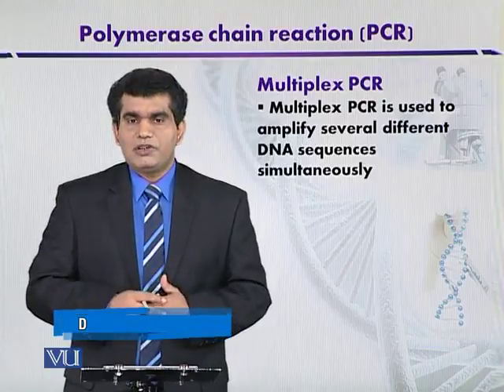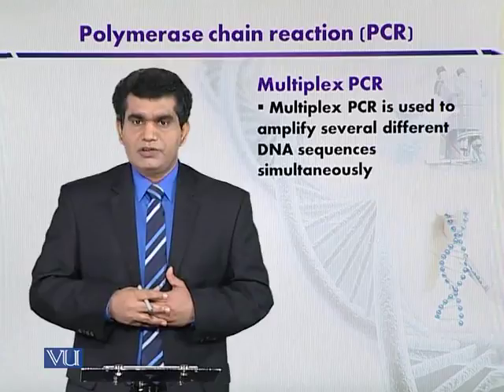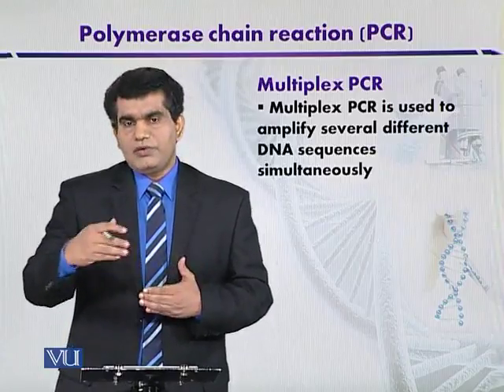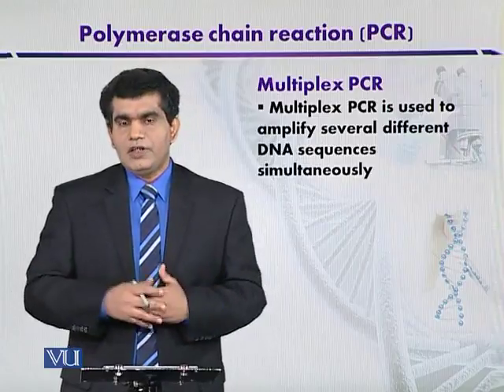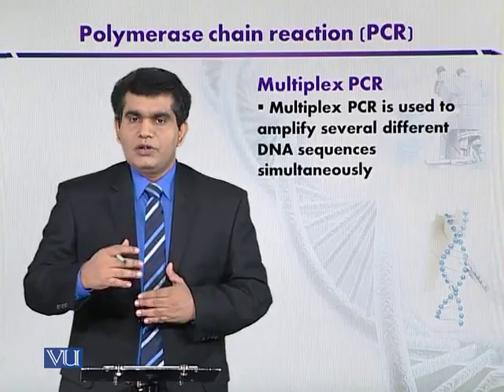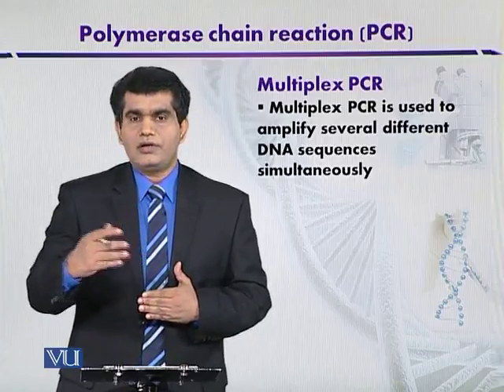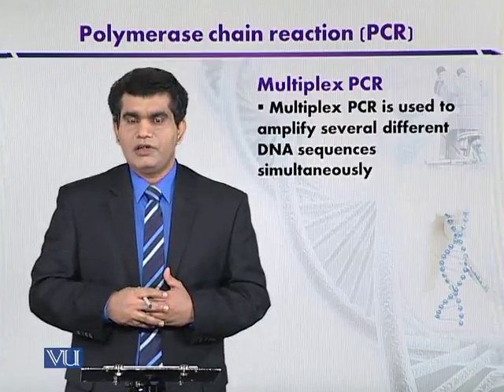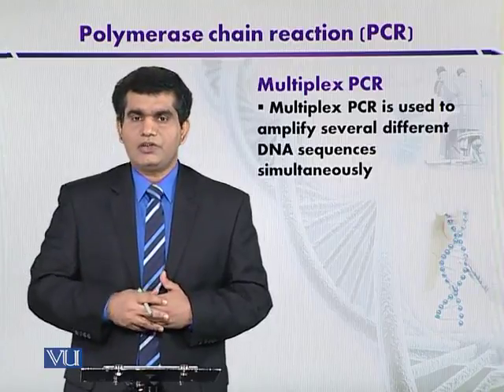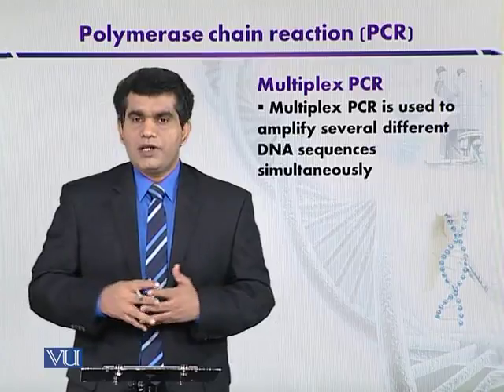This multiplex PCR can be used for different applications, as in the case of the diagnosis of different diseases. It can be used to find out the mutations in intronic or exonic regions of the DNA, and the gene dosage effect can also be determined by using multiplex PCR.